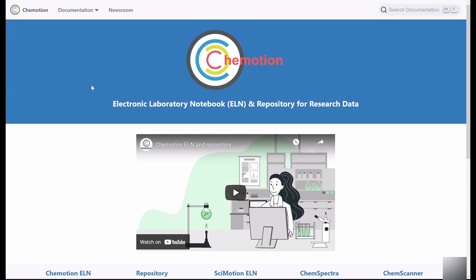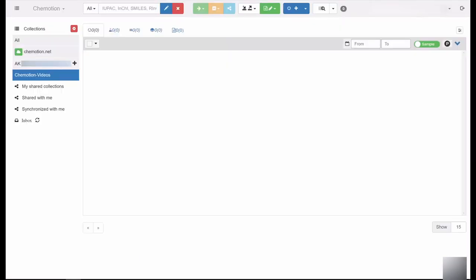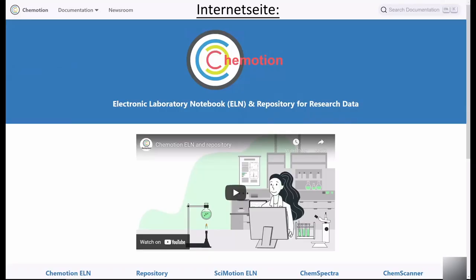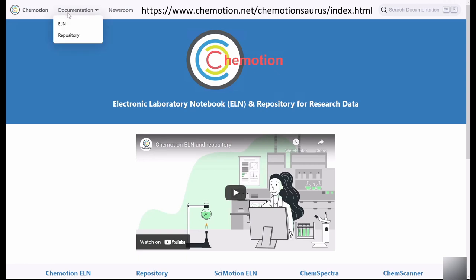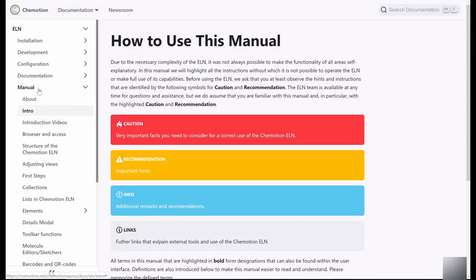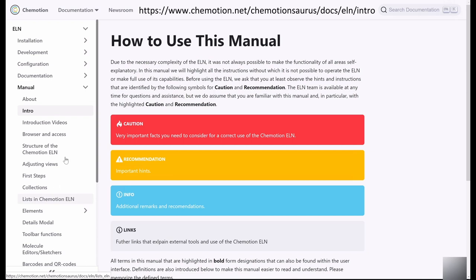After logging into the ELN, the following overview page will appear. The exact login procedure for the Chemotion ELN will be explained in detail in a separate video. Alternatively, instructions for the login procedure can also be found on the Chemotion website. The link to the website is included in the video description.